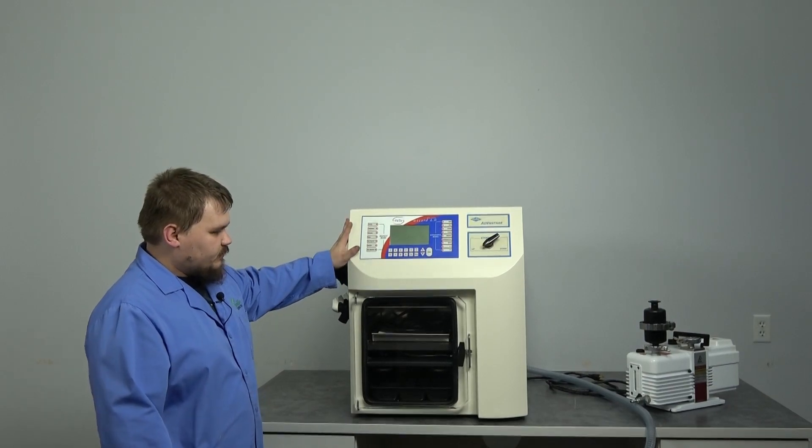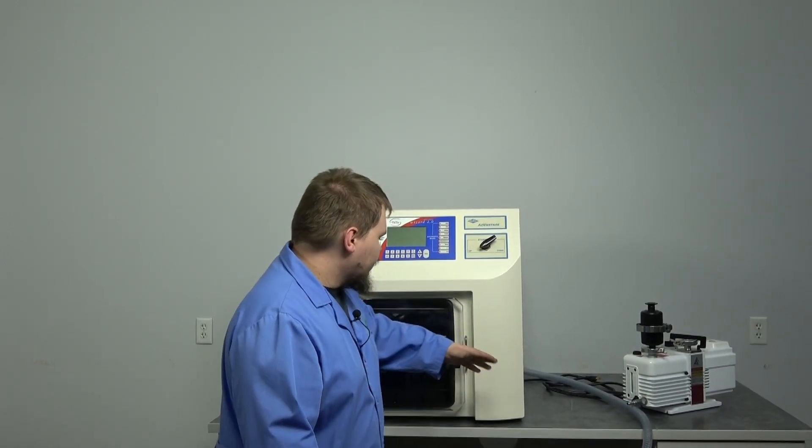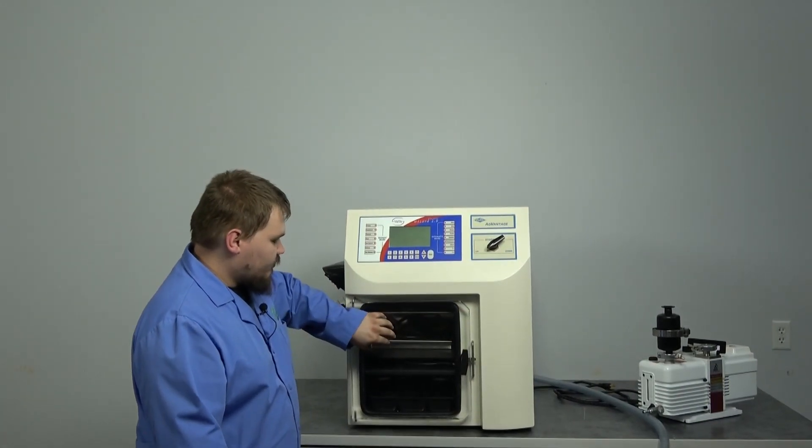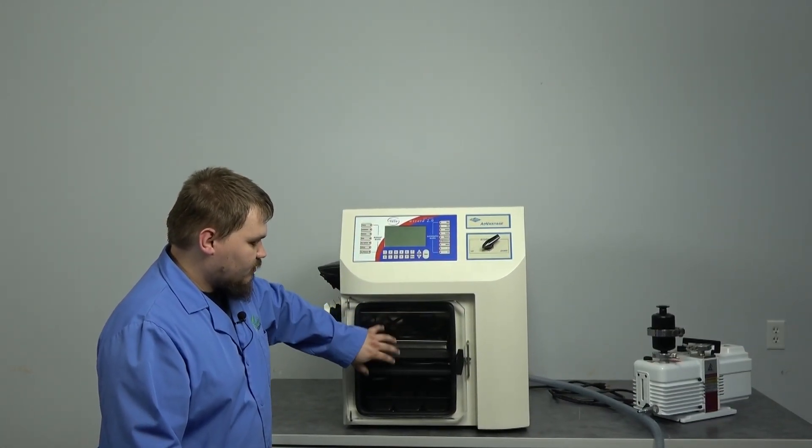We've got the machine here, we've got the vacuum pump, the power cord right back there, and a couple items here inside the machine.